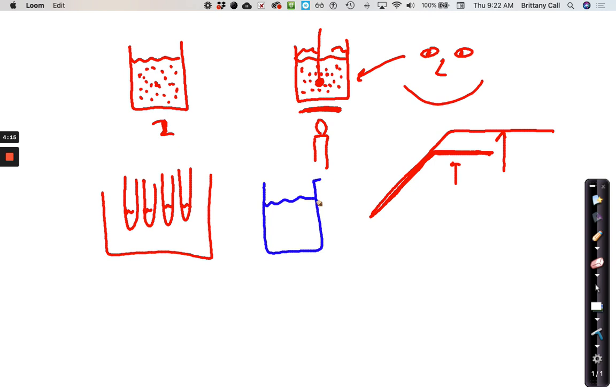What it does is you're just going to put it into the bottom, and it makes it so that we have a more controlled boil. You know how sometimes when you boil it, it starts to bubble and splatter all over the place? The boiling chips give it a place for the bubbles to start, and it helps it be more controlled, which we want. We want it to be more controlled this time.